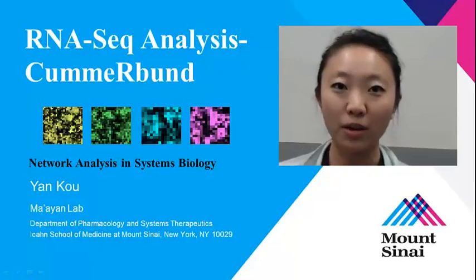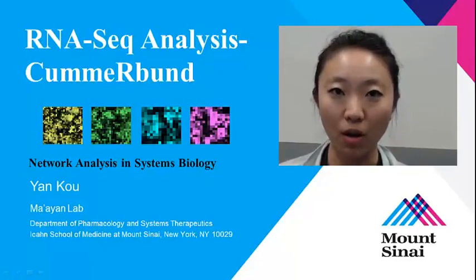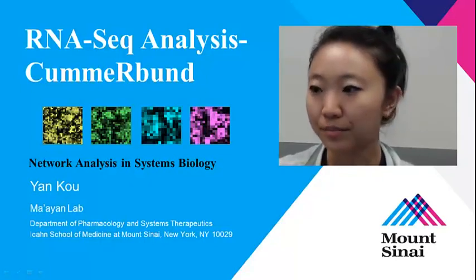Hi everyone, welcome back. In the previous lecture, we've learned the basic operation in R and the work environment RStudio. Now let's start with the CummeRbund and learn how to use it for the downstream RNA-seq data analysis.